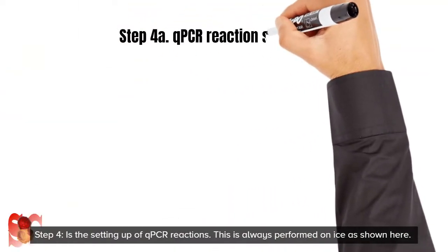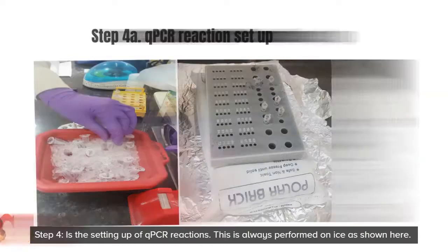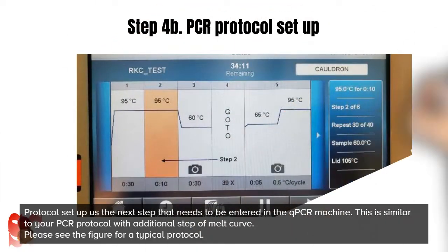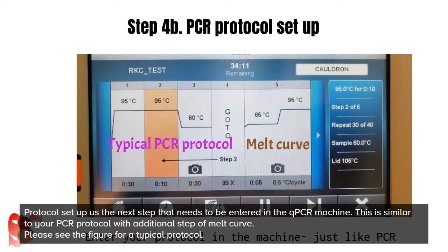Step 4 is the setting up of qPCR reactions. This is always performed on ice as shown here. Protocol setup is the next step that needs to be entered in the qPCR machine. This is similar to your PCR protocol with the additional step of melt curve. Please see the figure for a typical protocol.